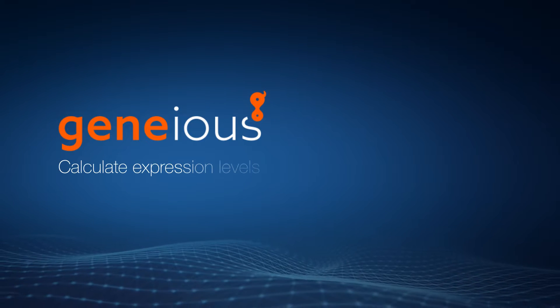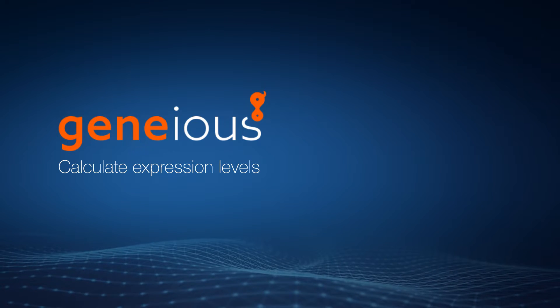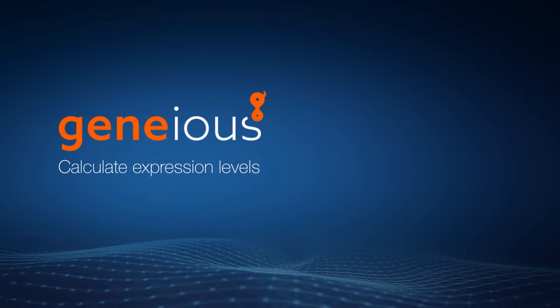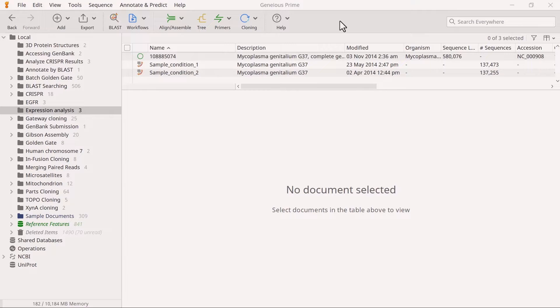Welcome to this video on calculating expression levels using RNA-seq data with Genius Prime. To calculate expression levels, you must first map your different sets of reads to a reference sequence. In this example, I have two sets of RNA-seq reads, each from a different experimental condition.